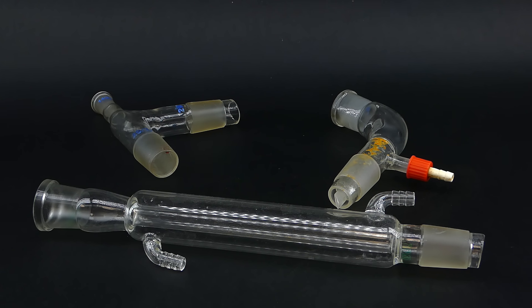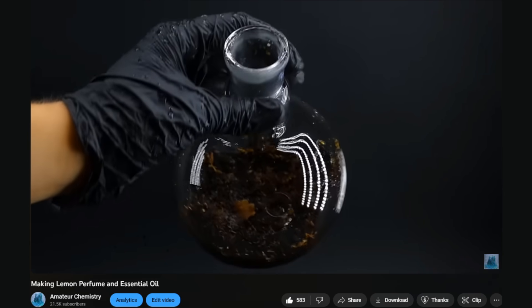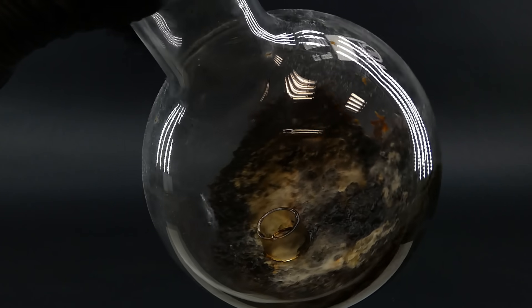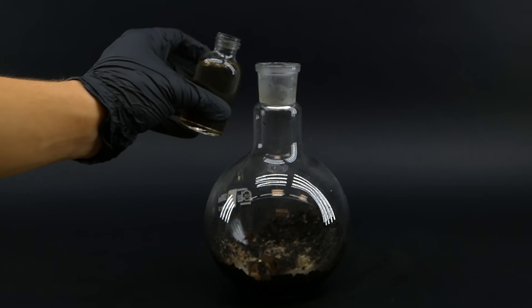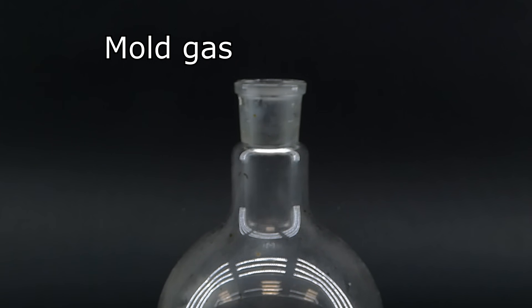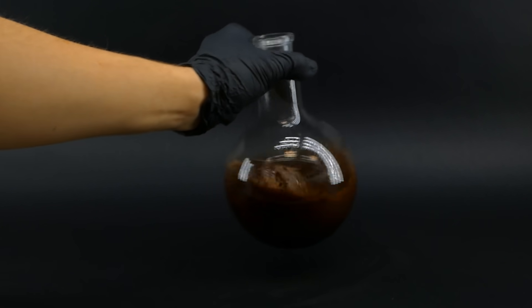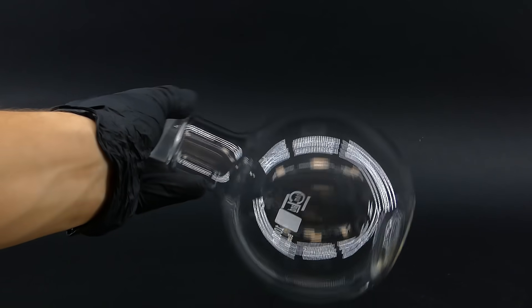After cleaning up that mess, it was time to steam distill the cinnamon powder. To begin I started setting up my distillation apparatus, but then I noticed that my boiling flask still had some remains from the lemon peel incident, and they had turned into a disgusting mold garden. I cleaned it by literally drowning the mold in concentrated sulfuric acid, which made everything heat up a lot and produced some nice smoke. To finish obliterating the mold, I added some hydrogen peroxide, which in combination with sulfuric acid makes something called piranha solution — it just obliterates all organic matter. After a few minutes I was left with some nice hot mold juice, which I then removed, and now the flask looks like it's new.